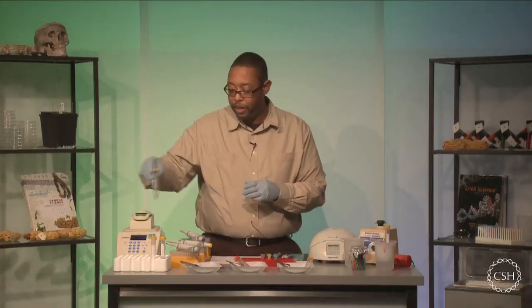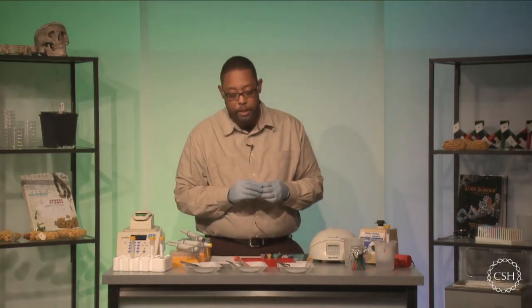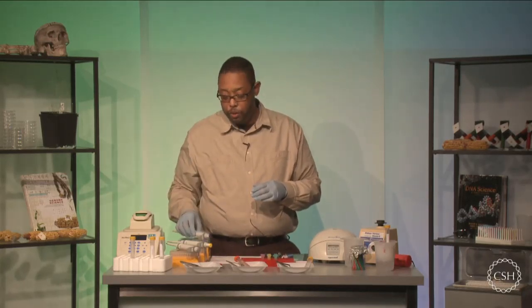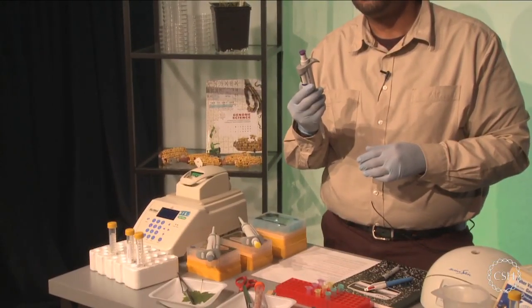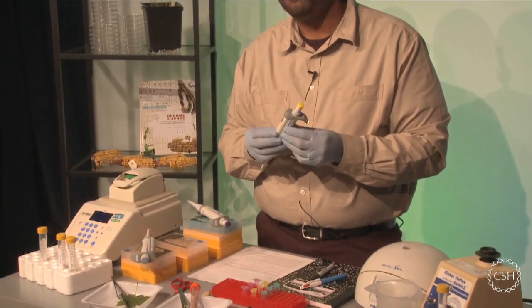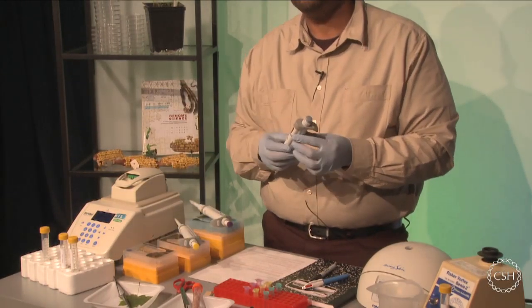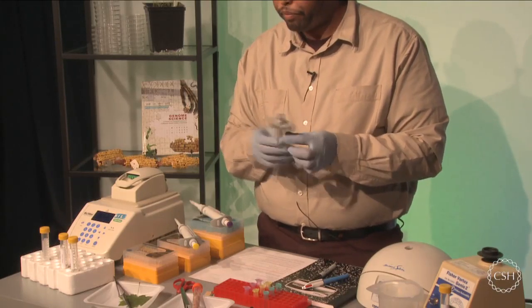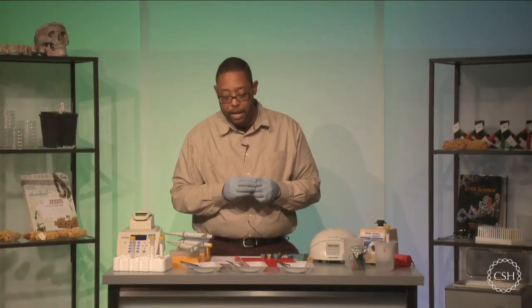Now, of course, my test tubes are really large, but yours may be small because you only need small aliquots to actually proceed on with this experiment. But nonetheless, we have all the reagents that we physically need here. Now, hard equipment, we're going to need some pipetters. We should have a P1000, which will go from 100 to 1,000 microliters. We are going to need a P100, which is going to go from 10 to 100 microliters. And we're going to need a P10, which is going to go from 0.5 microliters to 10. If you notice, I also have the tips that correlate to each pipette as well.